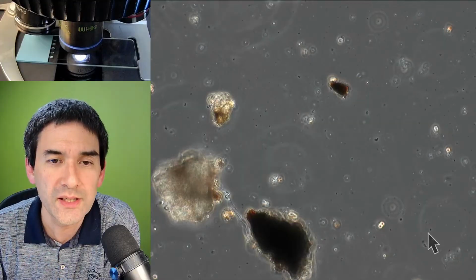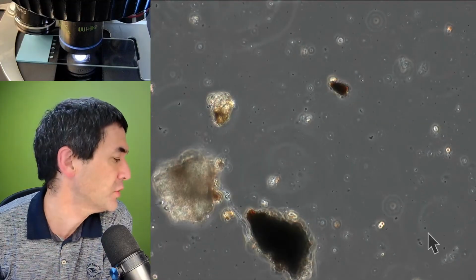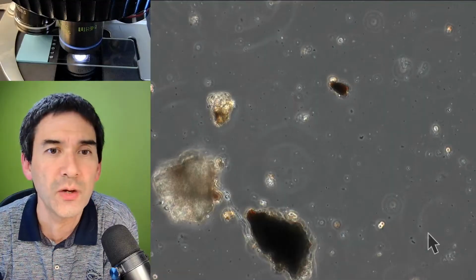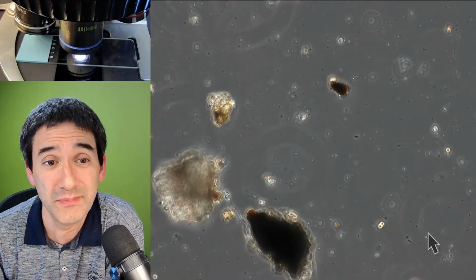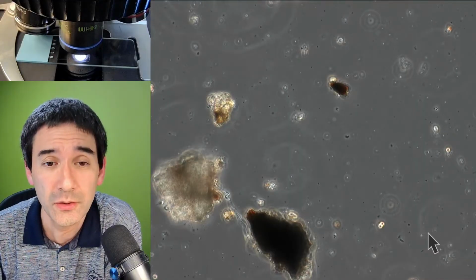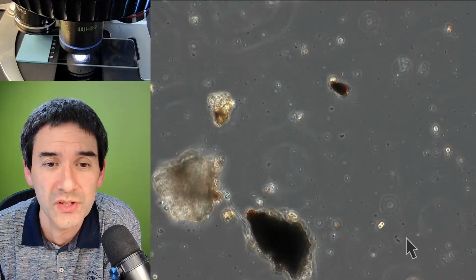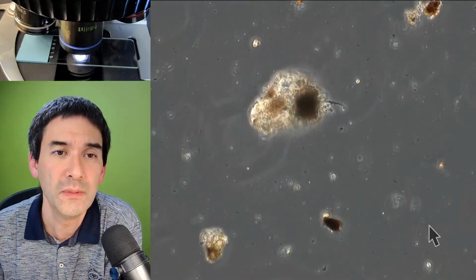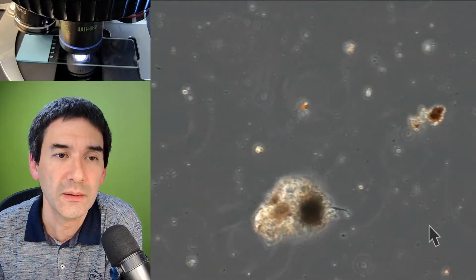So what I'm trying to say here, and that's maybe one of the questions over here, is: do you need specific equipment? And I'm saying, well, if you want to see bacteria better, you're better off with phase contrast because it's just easier to see. Right, but it's not absolutely necessary.